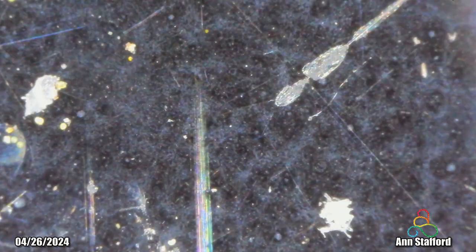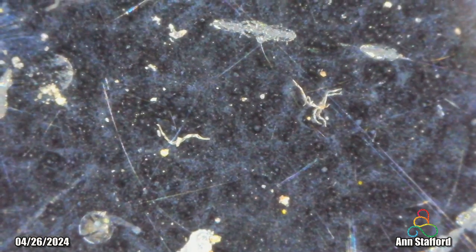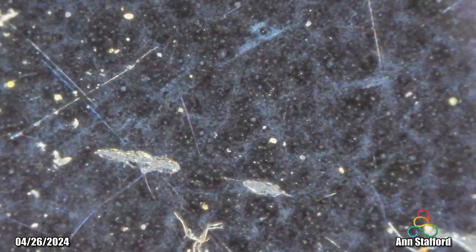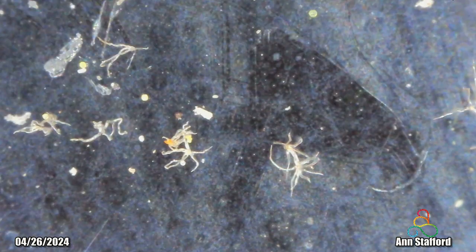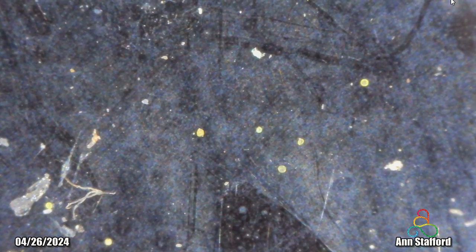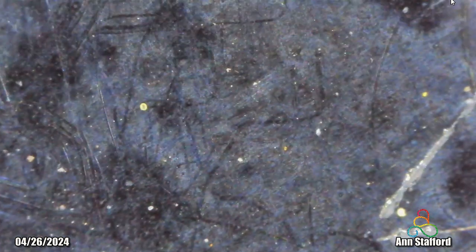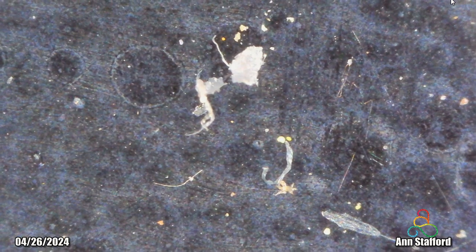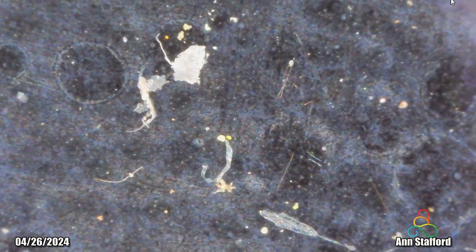It's really close to the edge, so I'm on top of these, but there's some I'm assuming are probably there that I just can't get to because I'm right at the edge, and this tray has a lip, it raises up, so I can't push the microscope all the way to the actual edge because it stops. It's got this little guard around the lens, so it stops maybe half an inch from the edge. And there's some more.